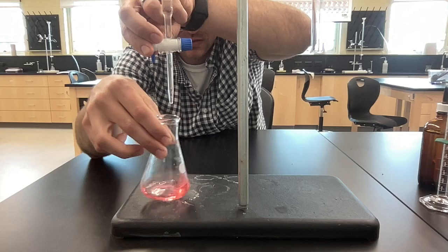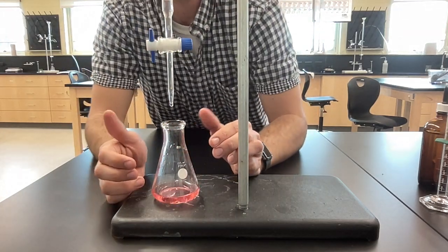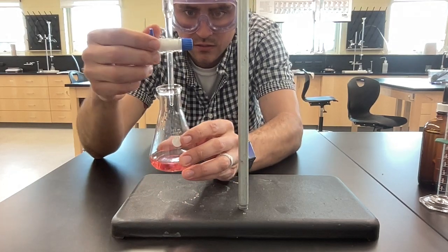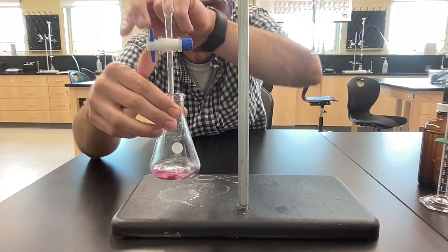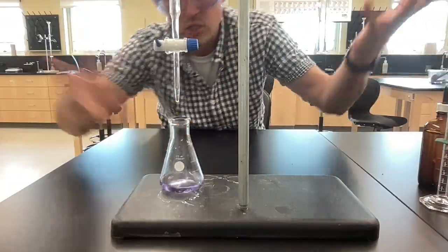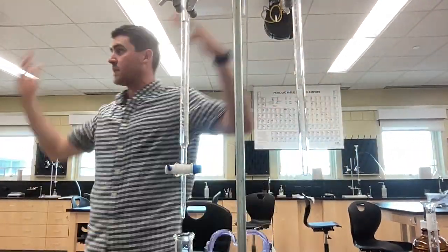Come on. Where am I at now? 9.5. Swirl it. Come on. There we go. Whoa. What? One drop, folks. I added one drop and it goes from acidic to basic just like that. Unbelievable. What does it add up to?